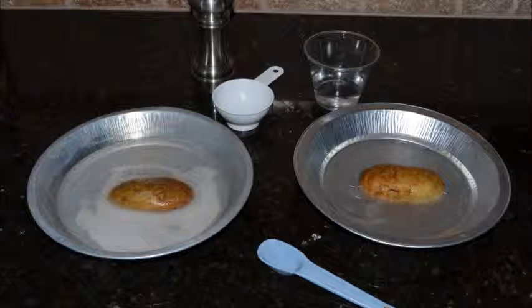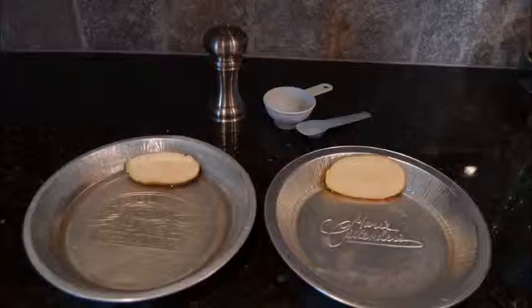Place 1/2 of the potato in each solution with the cut side down inside the solution. Leave this alone for a few hours. When we come back to the potatoes, we will examine them.